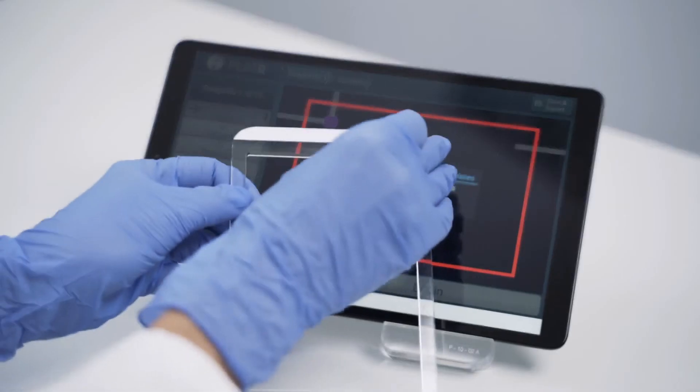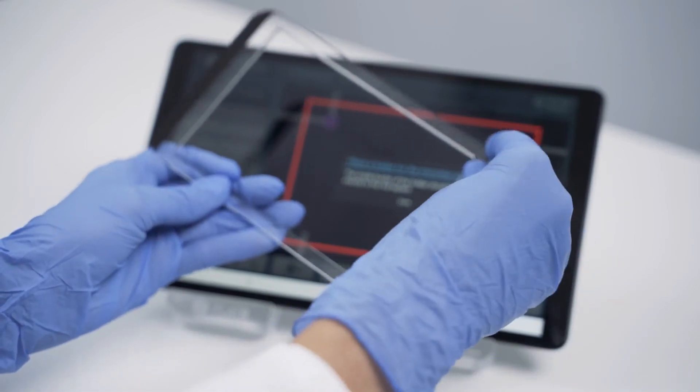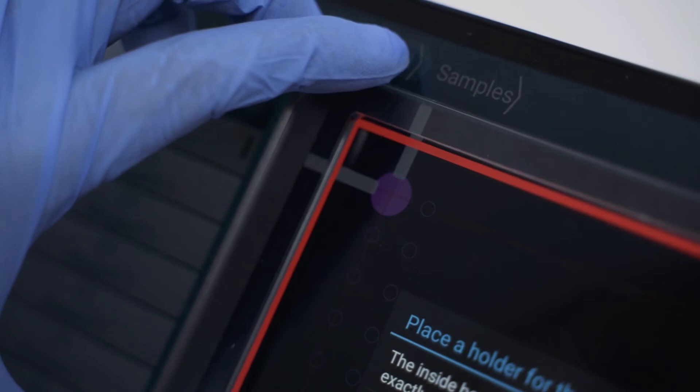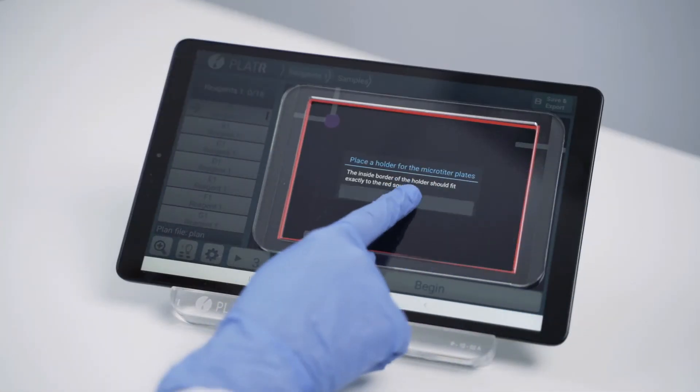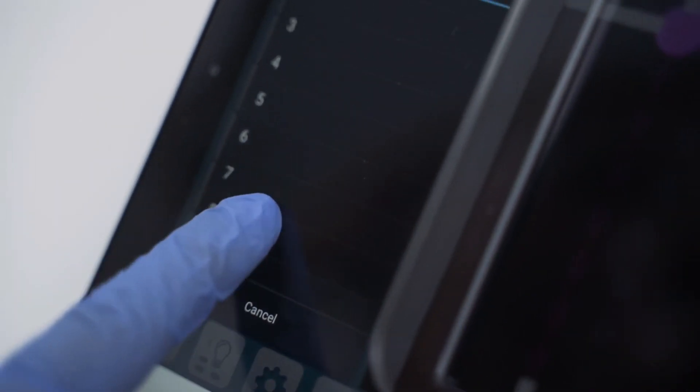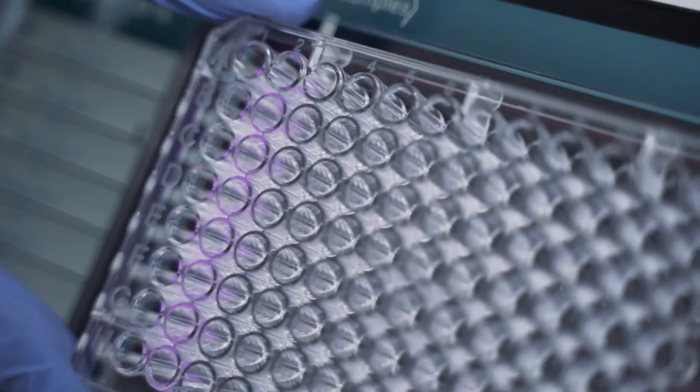Take one of your adhesive holders and place it on the red square. Don't worry, the screen is locked. Set your pipet. Since I'll add reagent number 1 to all wells, I'll use a multi-channel pipet.